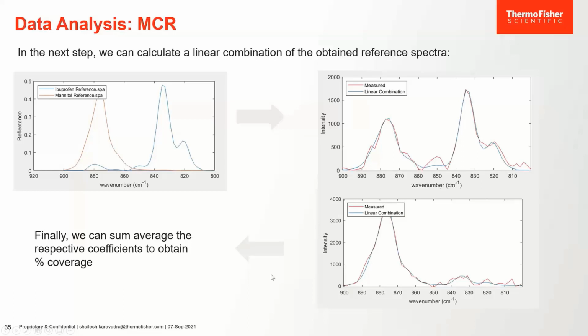If you had to create a PLS equation for separately looking at ibuprofen and mannitol reference, one had to create a calibration based on PLS with several lots of tablets. But with this approach and automating the MCR analysis, this result can be completed in less than an hour.